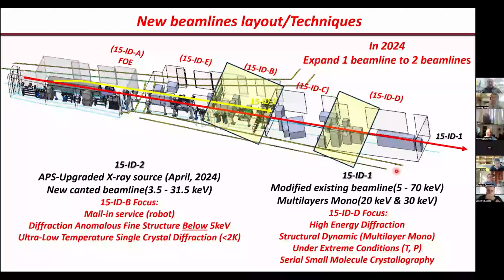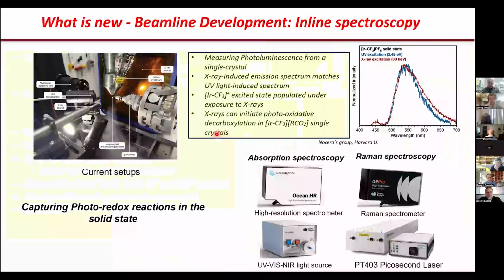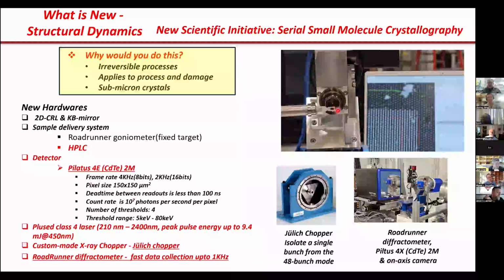And for the other camera, the distance is 2.25 millimeters.